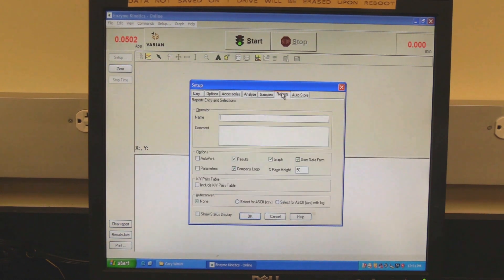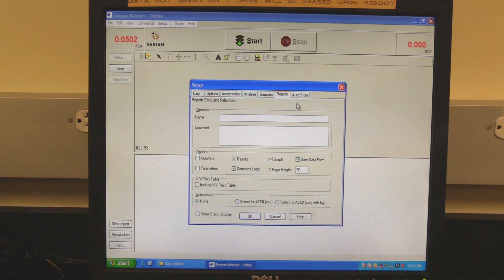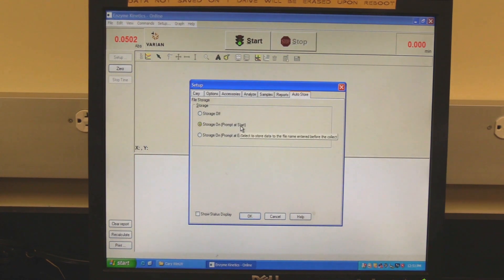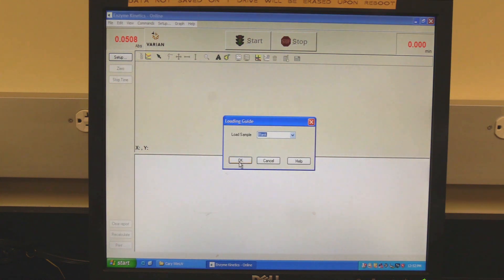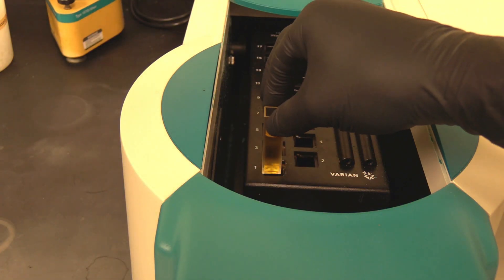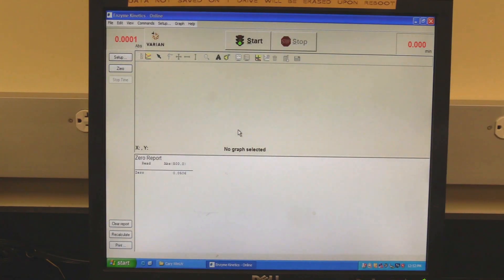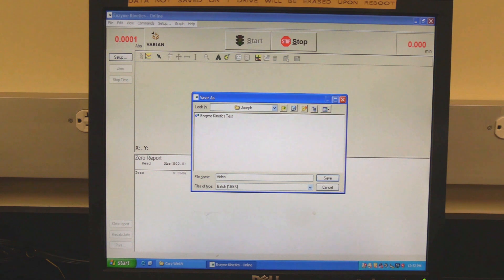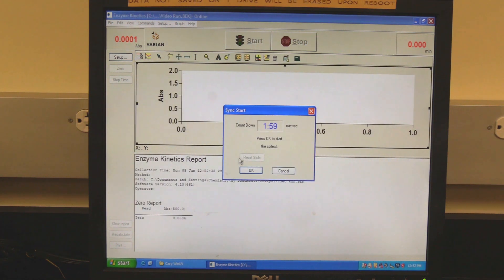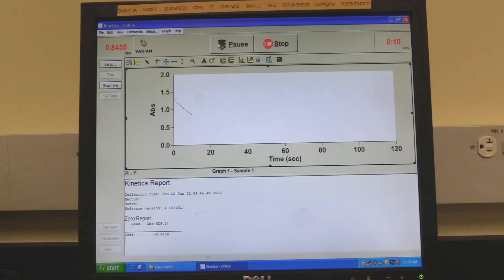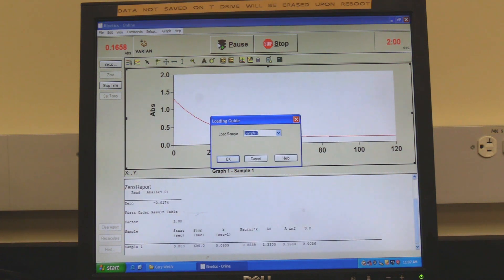Click on the Reports tab. In XY pairs, check the Include XY Pairs table box to include the table of XY values in the report. Click on the Auto Store tab and select when the software should prompt for the data to be saved. Click OK to set the setup parameters. Click on the Zero button and when prompted, click OK. In some cases, the instrument may need to be zeroed twice. Insert the sample cuvette in the sample chamber as demonstrated in the wavelength scan measurement. Click on the Start button. If Save at Start was selected, the software will prompt the operator to save. Find the appropriate folder, name the file, and click Save. The software will prompt for the sample name — click OK. The countdown timer will appear. Add the reaction reagents to the cuvette in the sample chamber and click OK. Wait for the measurement to finish; the spectrum will appear. If measuring another sample, click OK. The report area will have the calculated data.